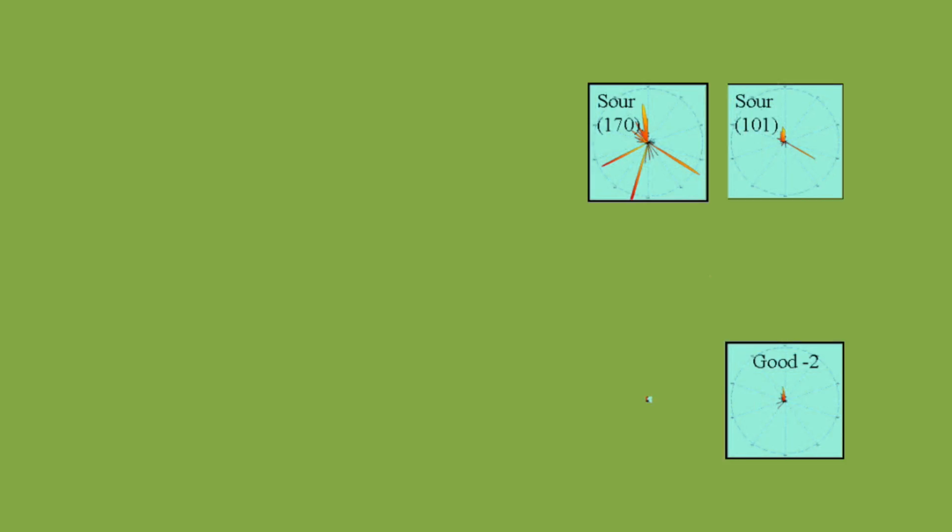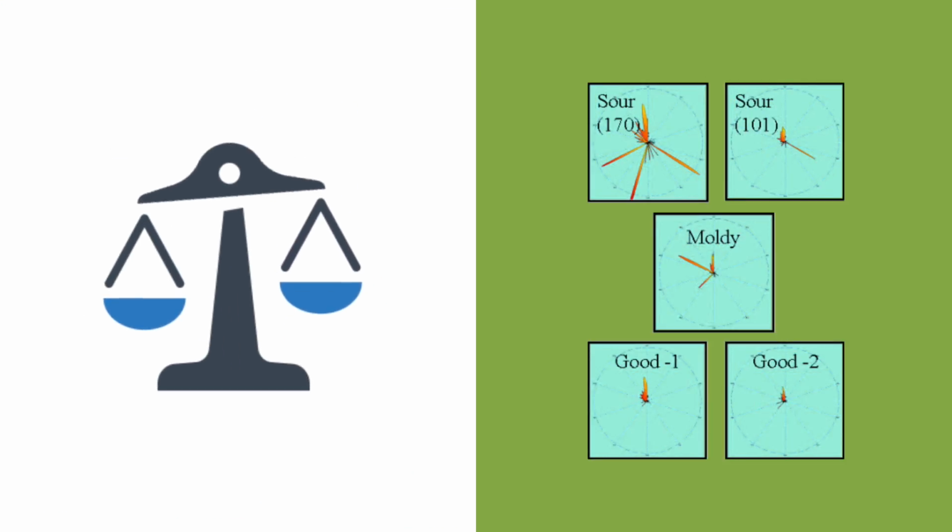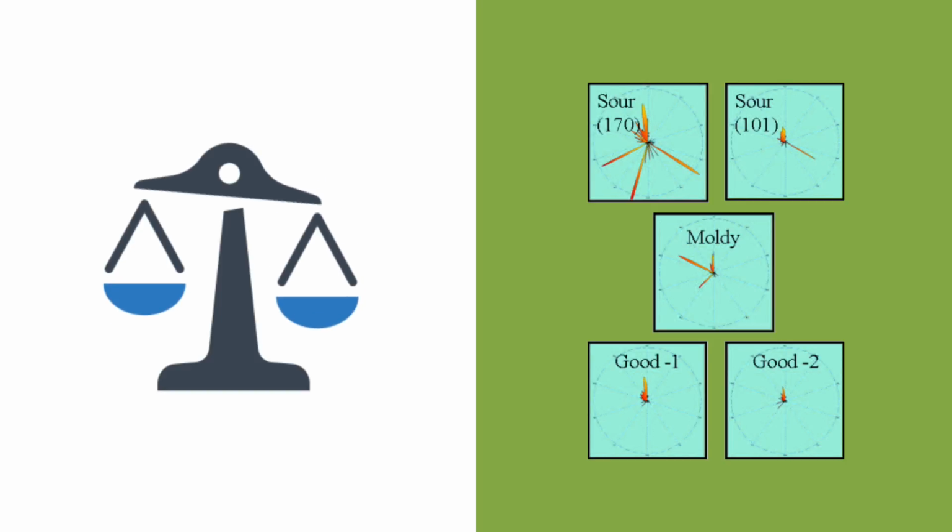The olfactory images of all 5 corn samples also indicate a comprehensible comparison. The relatively odor-free chromatograms of both good corn samples give only small images, as their odor concentration is low. Whereas, the lactic acid peak of sour samples and the distinctive compound peaks of moldy corn are easily recognizable, indicating high concentrations.